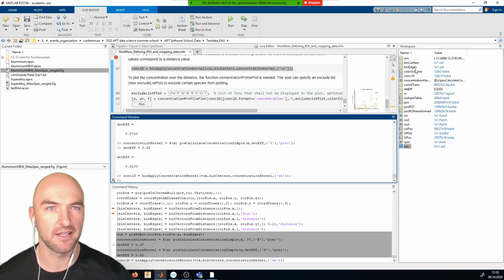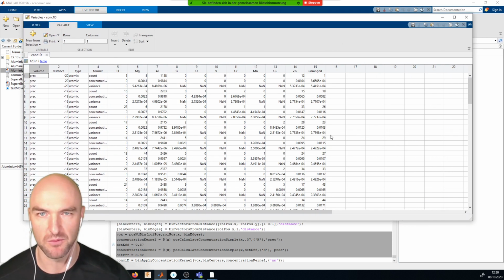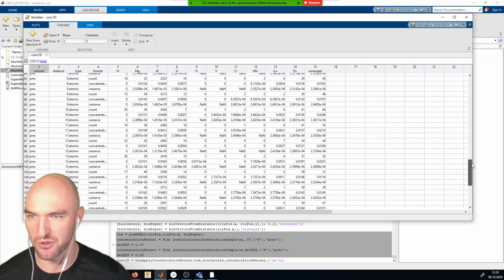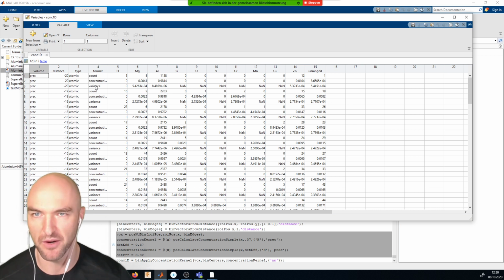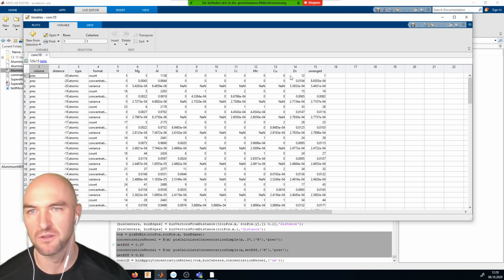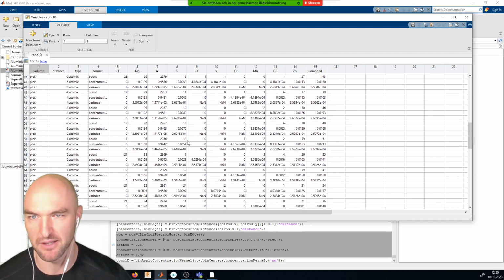And once we have that, I can go into our cons1d variable. It might look familiar already from yesterday. What we have here is essentially a whole list of those concentration variables that we had yesterday with count, concentration, and variance for each of the elements. Now we obviously have a relatively small number of atoms in there, and most of them are aluminium. So very often we have no silicon, because at the beginning of the precipitate there is almost no silicon, but somewhere in the middle we probably have silicon counts. Yeah. So here we have silicon counts, right?